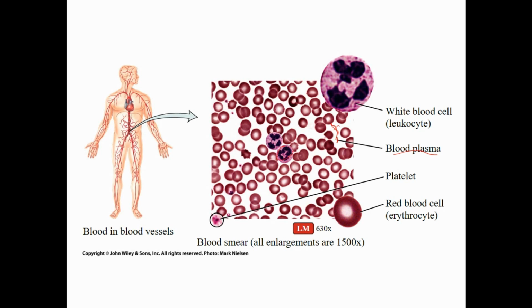This is a white blood cell. That's this guy right here. All of these that kind of look like little cough drops with their depression in the middle are red blood cells. And these little guys right here and right here, and they magnified one right there, those are platelets. That's what enables our blood to clot. So this looks like a whole bunch of cough drops lying on the table.